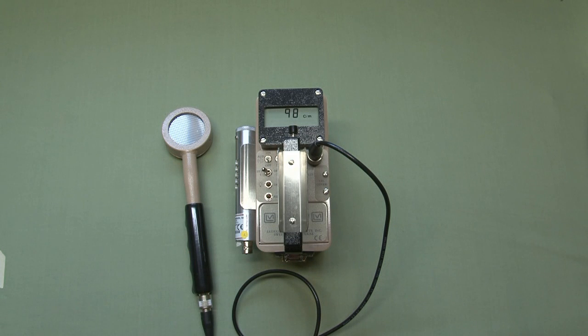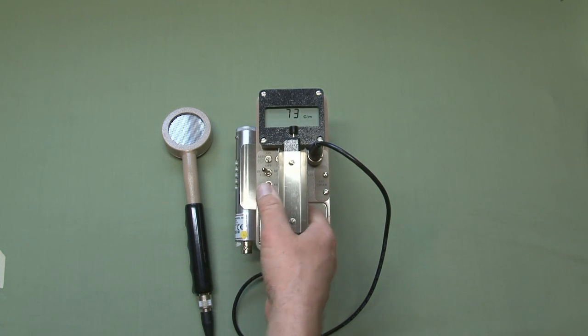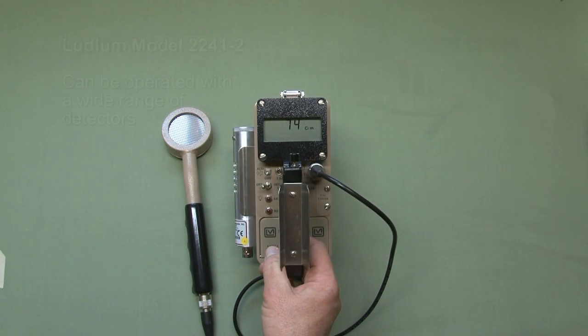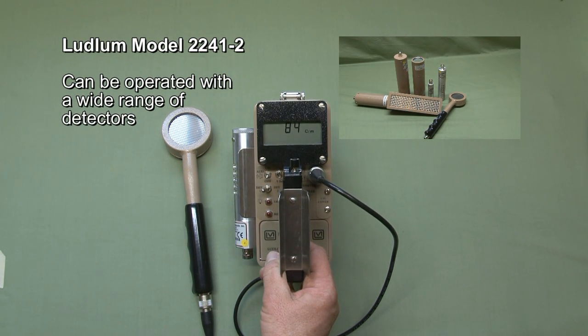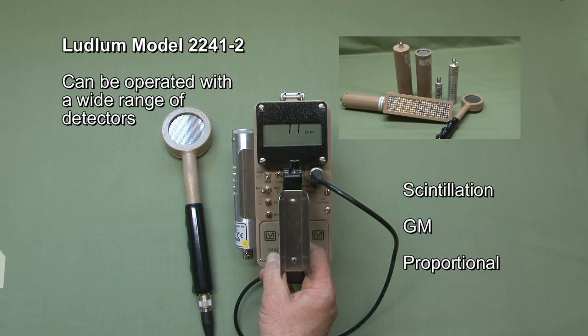One great feature of this instrument is the ability to calibrate it with two different types of detectors. It has a regulated high voltage supply with two independent set points adjustable from 400 to 2400 volts. As a result, it can be operated with a wide range of detectors including scintillation detectors, Geiger-Mueller or GM detectors, and proportional type detectors.